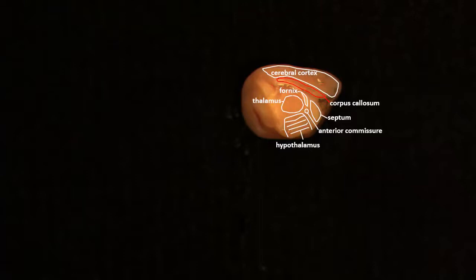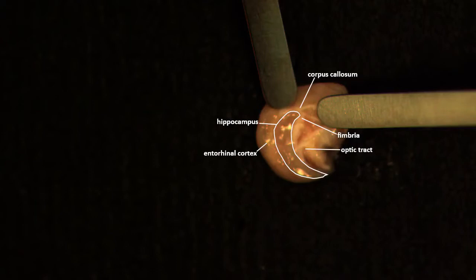Next, flip the remaining tissue so that the medial side is facing up. Now you need to remove the tissue covering the medial surface of the hippocampus. Using one spatula to hold down the tissue, insert the tip of the other spatula right below the corpus callosum and gently pull out the thalamus, the septum, and underlying striatum, and cut away this block of tissue. The hippocampus is now clearly visible with its banana shape.